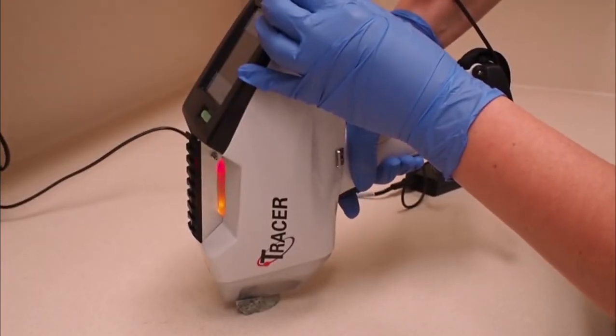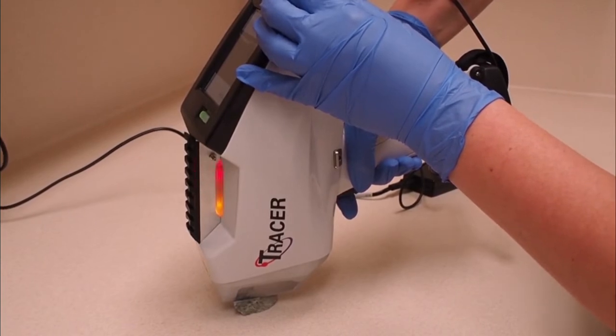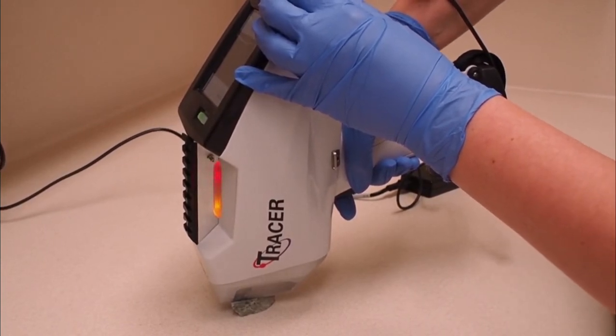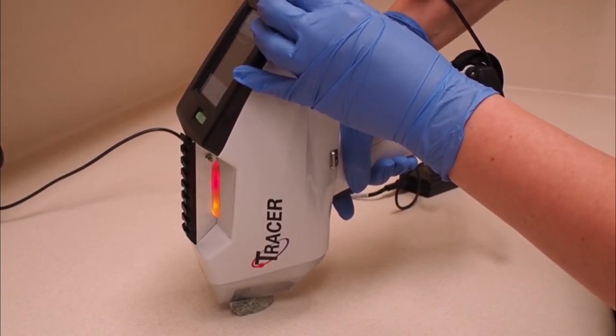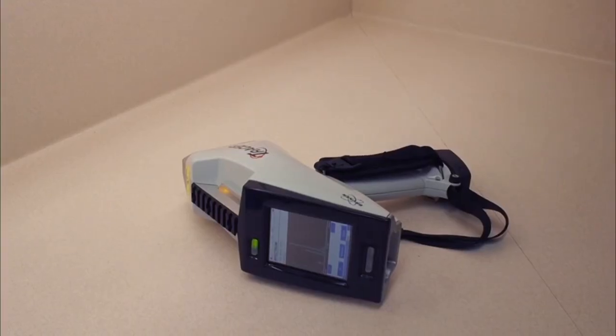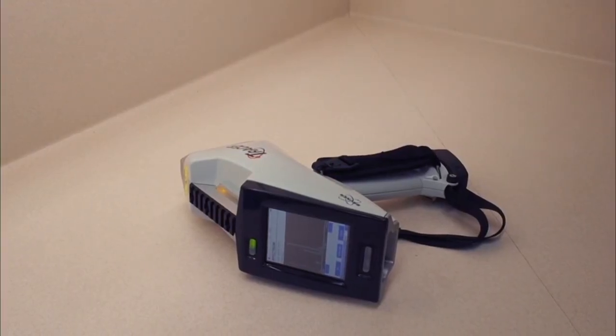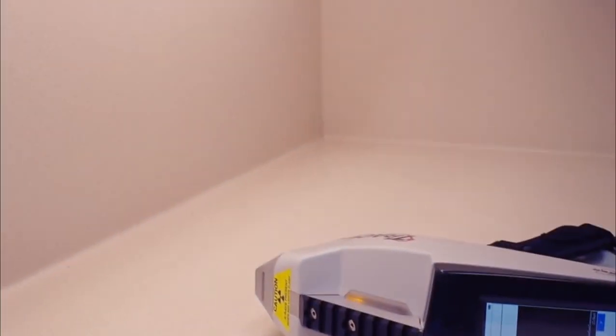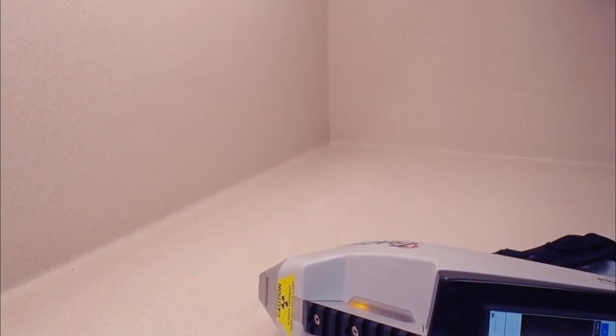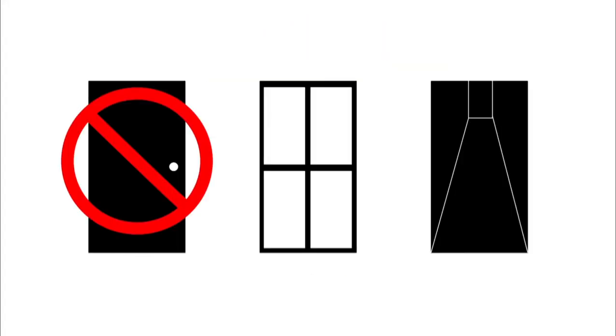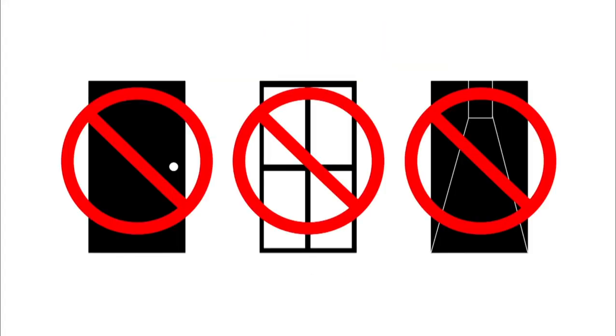If you need to hold the tracer for analysis, make sure that when it is not being actively used, the instrument is positioned on its side on a flat surface and that it is always kept pointing away from people, doorways, windows and thoroughfares.